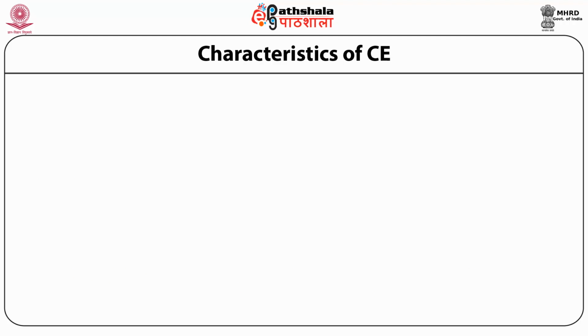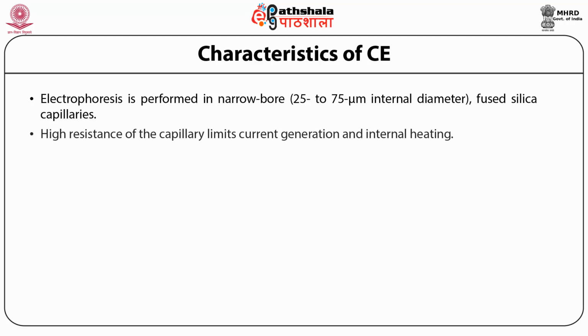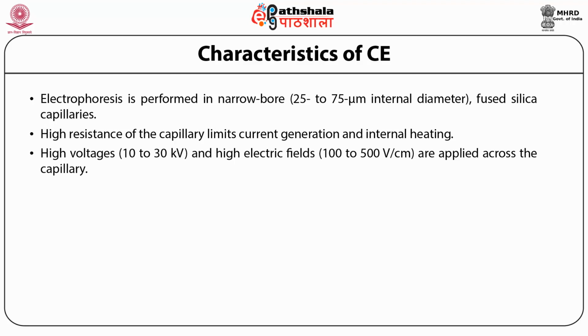The characteristics of capillary electrophoresis. There are several characteristics of CE which are the following. Electrophoresis is performed in narrow bore, 25 to 75 micrometer internal diameter, fused silica capillary. High resistance of the capillary limits current generation and internal heating. High voltage, which is 10 to 30 kilovolts, and high electric field, which is 100 to 500 volts per centimeter, are applied across the capillary.